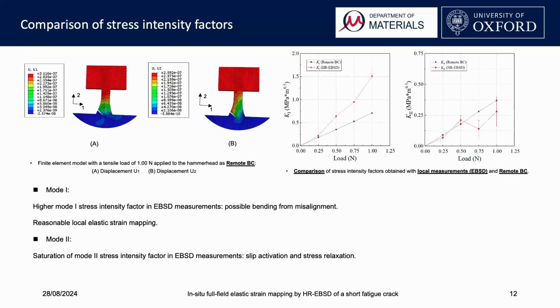And interestingly, unlike mode 1 stress intensity factors, mode 2 stress intensity factors have limitations. It doesn't increase with the load. It saturates in subsequent load steps.